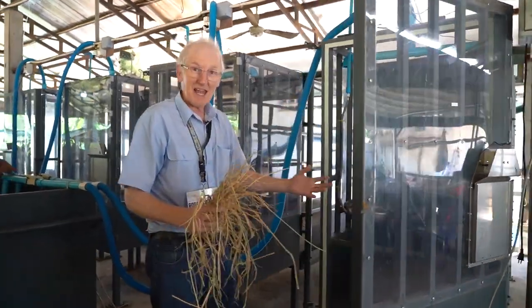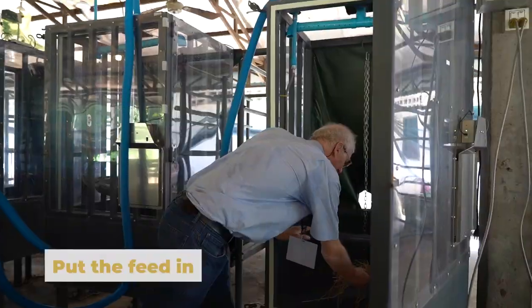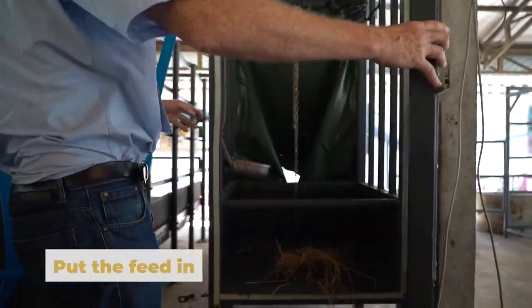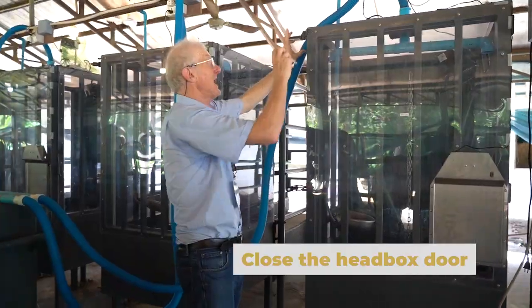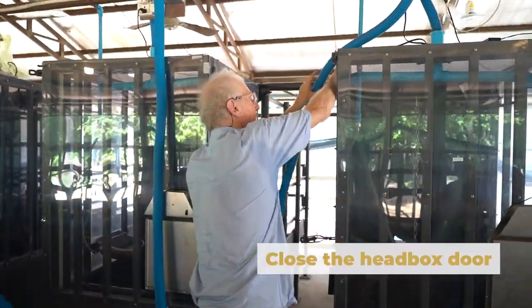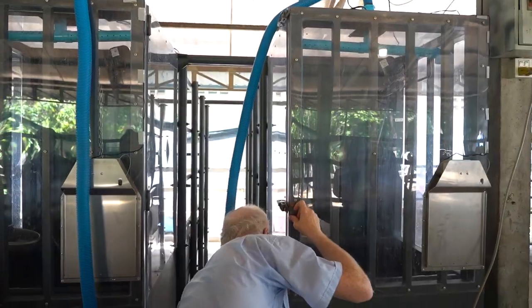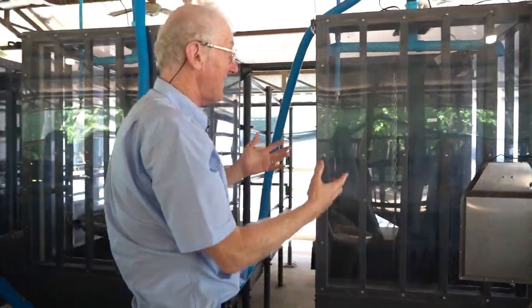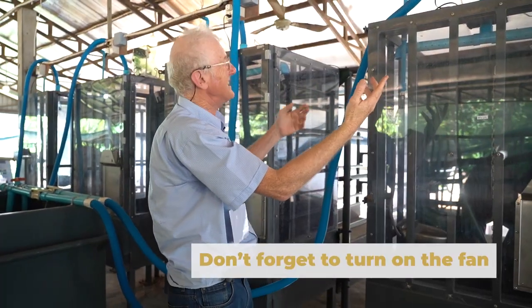We've got our cow in there. When we're ready to do the experiment, we usually put the feed in, we shut the door, and we have the exhaust fan going that is pulling maybe 500 litres per minute. We close the toggle valves. Now the cow is trapped, but I forgot to turn the fan on.